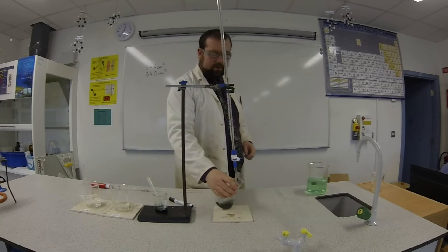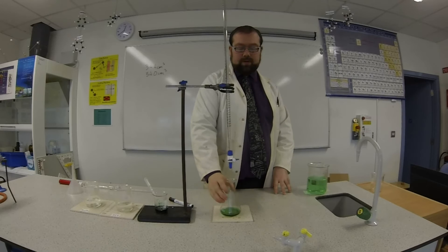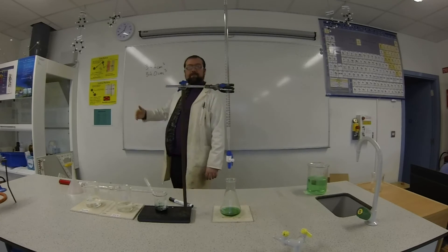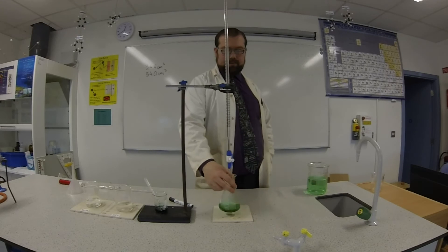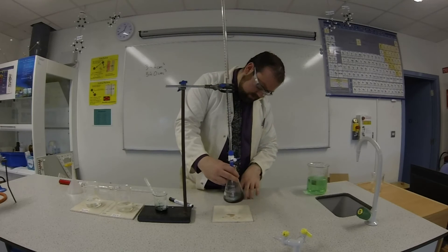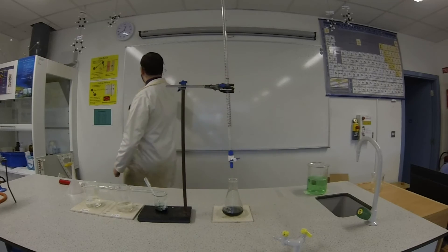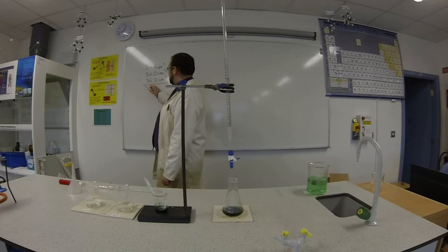I'm going to do this one more time just to be absolutely sure of our results, so it's going in the waste beaker. I've got my 25 cm³ of sodium hydroxide in here and my acid all the way up to the zero mark, and I'm going to let it flow. Again we're looking at around 34 cm³, so you can let it flow pretty freely until you get closer to that mark, then add it a little bit slower. And that looks like it's no longer green. So we're at 34.2 cm³.